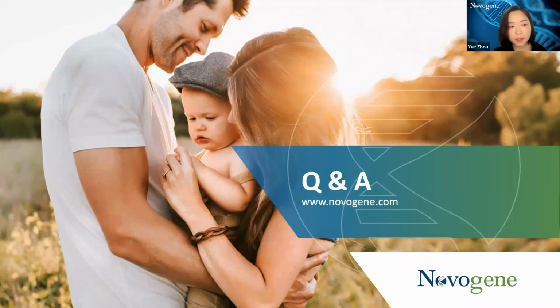So far it's a no, but it's definitely included in our standard analysis of RNA-seq, so that's still within the scope of the analysis we provide. Yeah, thank you, Aoife. Okay, thanks.